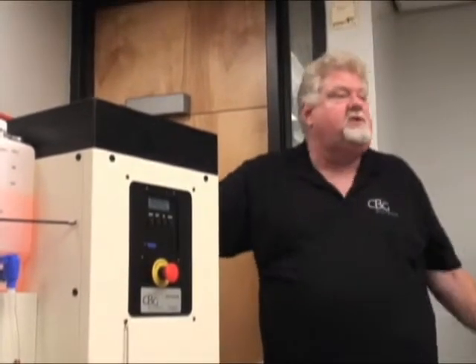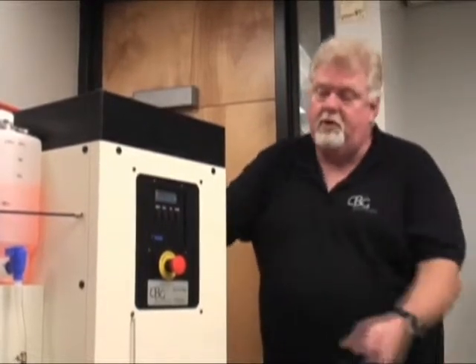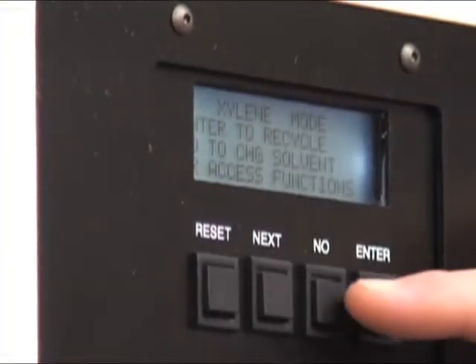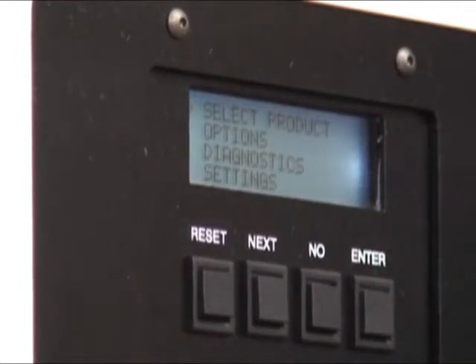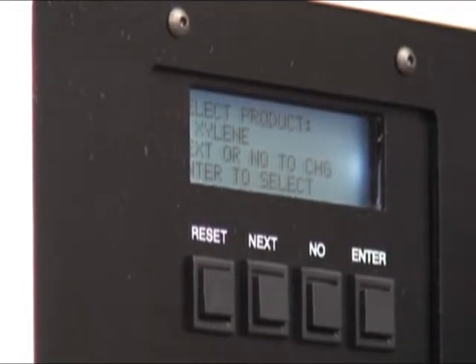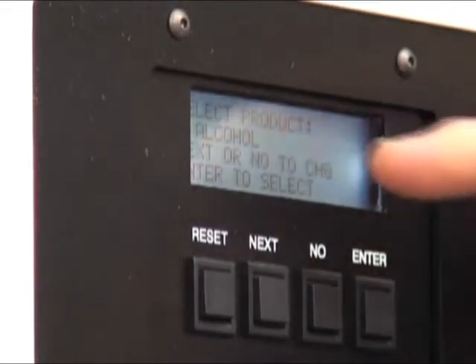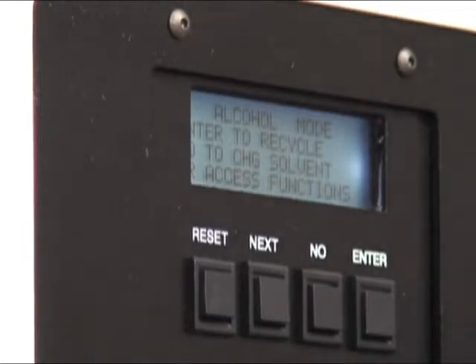It says xylene mode — the machine's done, so you want to start again. You'll just want to push reset, and it goes back to xylene. But you don't want xylene — you want to change the solvent. So it says no to change the solvent, so let's just press no. Select product — I want to select the product, that's where the little arrows are pointing. Press enter. Select product — it shows xylene. I don't want xylene, so let's press no. Alcohol — I want alcohol. Enter to select, enter. Reset your system. Now we're ready to do some alcohol.